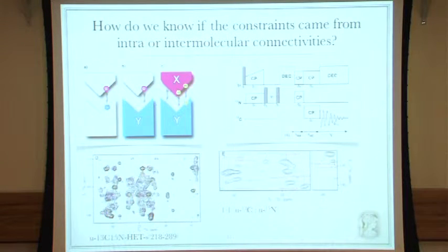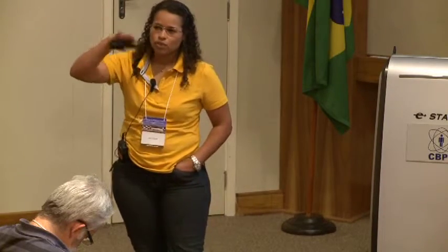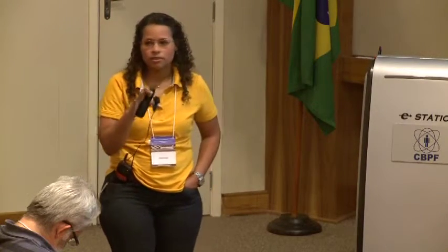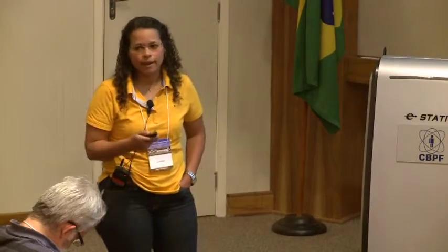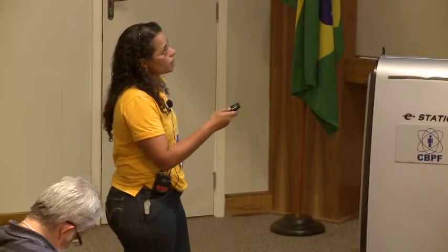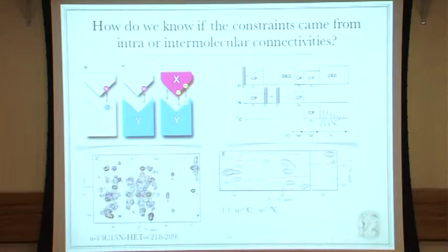Of course, you lose magnetization during this process because you have several CPs. In general, if you are applying, for instance, one specific CP with a shaped pulse, you can lose approximately 30% of your magnetization. But in this case, you have several CPs along the way. And in general, it's not like in solution, where you can use, for instance, 100 milliseconds as mixing time during the transfer of magnetization proton-proton. Here you use like 150 microseconds. So this experiment is quite nice because you can follow and see hydrogen bonds and so on.